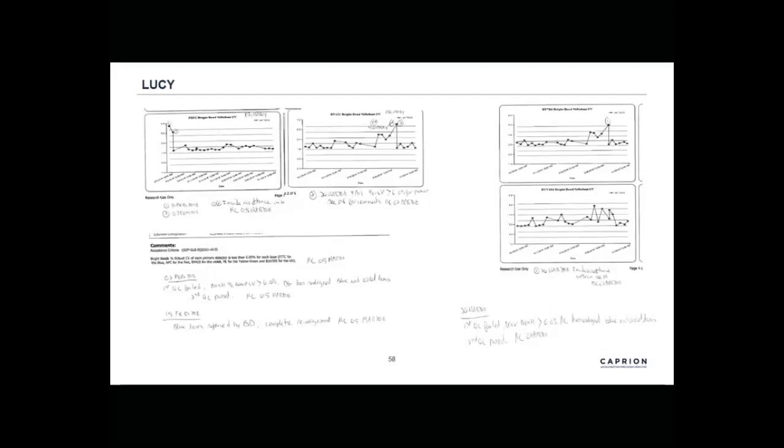And so, again, this is why we monitor and we document. So here, actually, we're within the 6%, but it's so far different from normal Lucy. So we'll do an investigation there and not use the instrument when it's like this. Here, if we've exceeded 6%, we will document that we had an issue and what we did. We realigned the lasers. So this is really important.